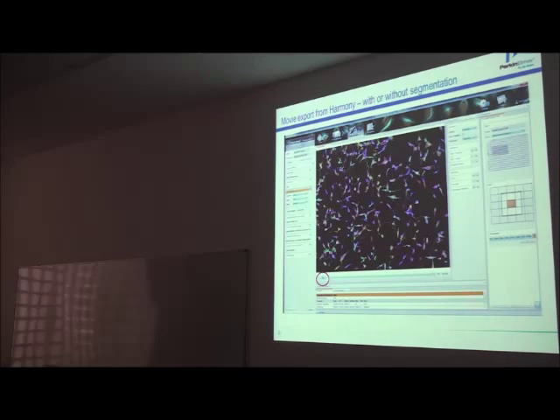But in this case, for instance, the fastest one I've done was really 3 frames per second and staying in the same position. Not changing. No, if you have only 3 frames per second, then by the time you go in, you come back. So it's a different application. Okay. Right? But this is like cell motility, so therefore you repeat it every 10 minutes or half an hour.